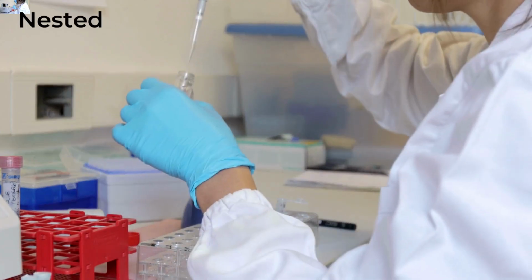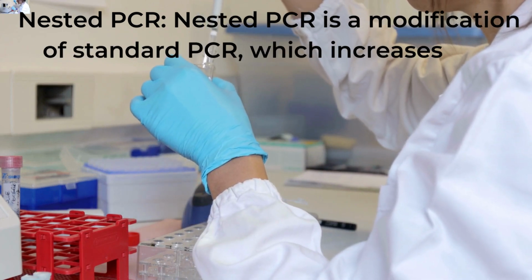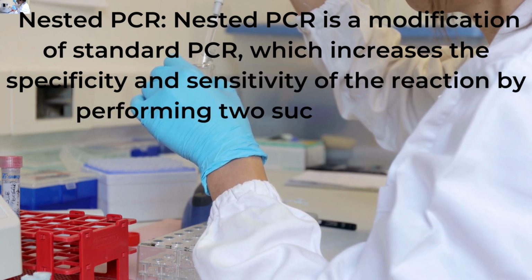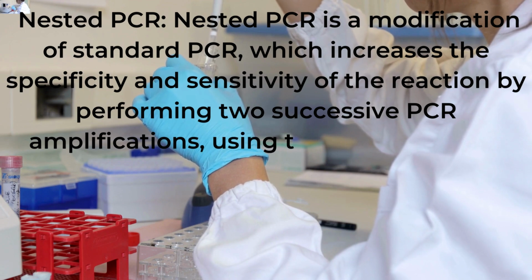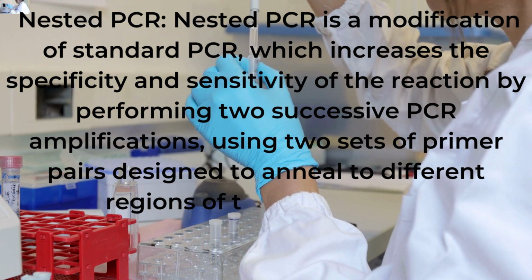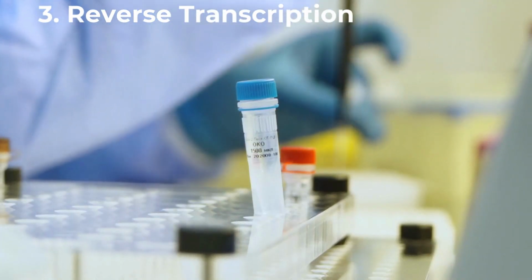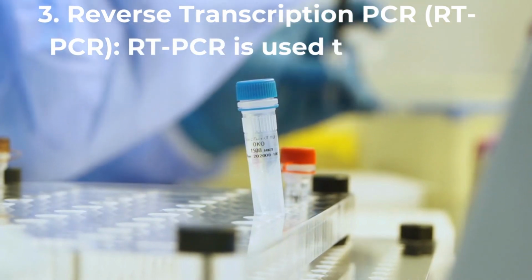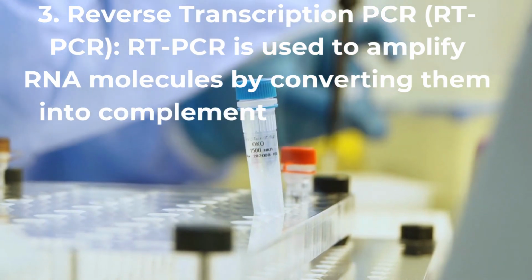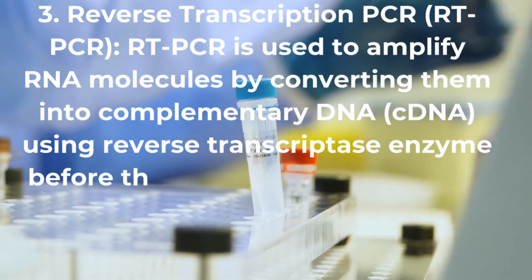2. Nested PCR. Nested PCR is a modification of standard PCR, which increases the specificity and sensitivity of the reaction by performing two successive PCR amplifications, using two sets of primer pairs designed to anneal to different regions of the target DNA. 3. Reverse transcription PCR, RT-PCR. RT-PCR is used to amplify RNA molecules by converting them into complementary DNA, cDNA, using reverse transcriptase enzyme before the PCR amplification step.